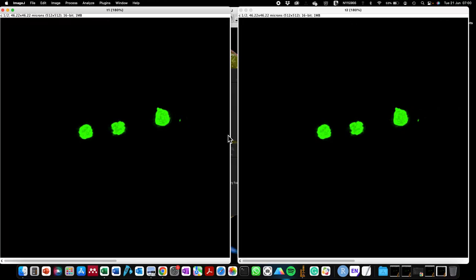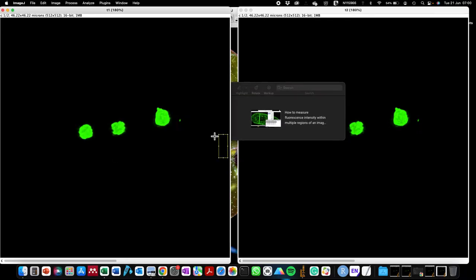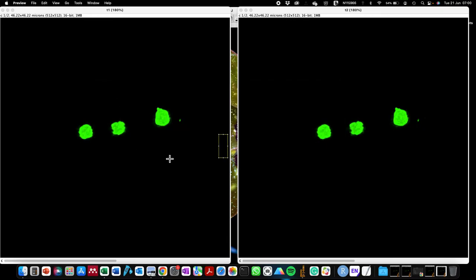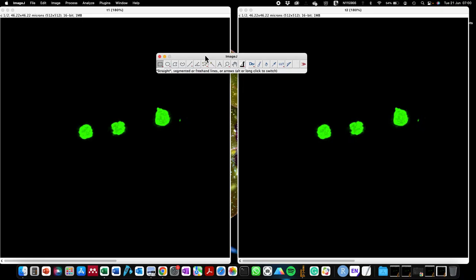I recently received comments that made me aware that I needed to record this video. There are two comments: one was asking about how to duplicate the region of interest — that's the first square box the person is referring to — and the second person was asking about how to get the second, third, and fourth region of interest, which I showed in one of my ImageJ tutorials.